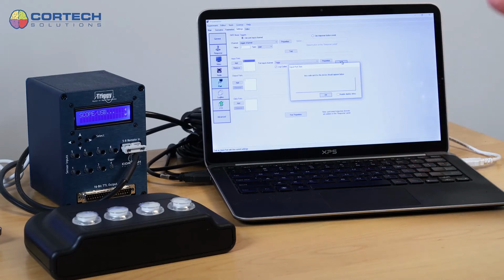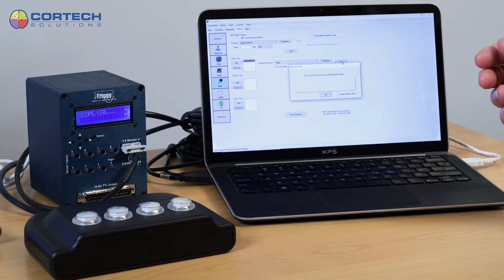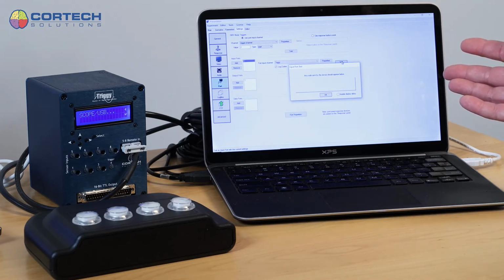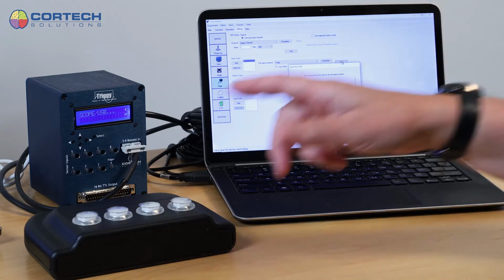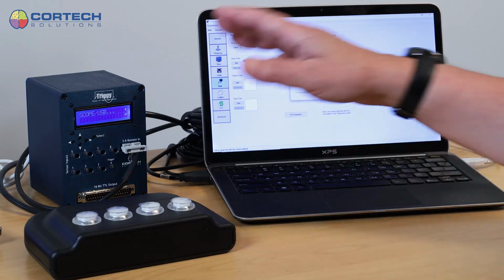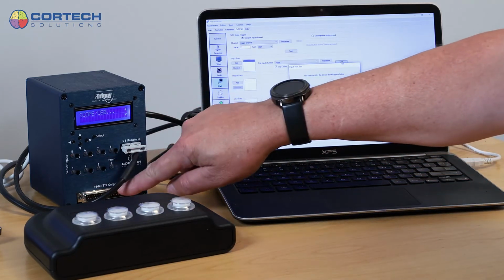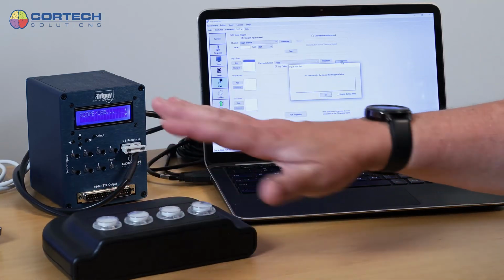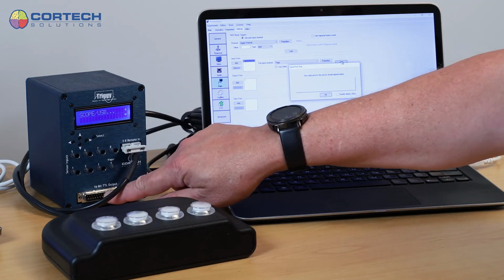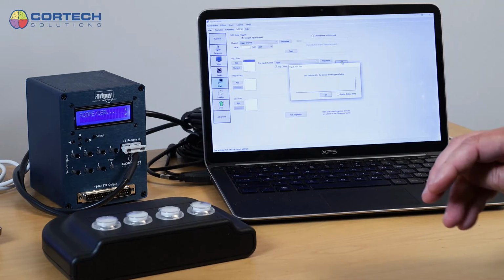So that's one of the basic elements of interfacing Triggy to your computer. Of course, in this case, it's only necessary if you want the experimental control software to log these buttons. If you're really only interested in using Triggy to reflect this change out the TTL output port, that is always true by default. So when I press this button and that light illuminates, a pin on the digital output port is raised by default. Let's look at some of the other modes here.